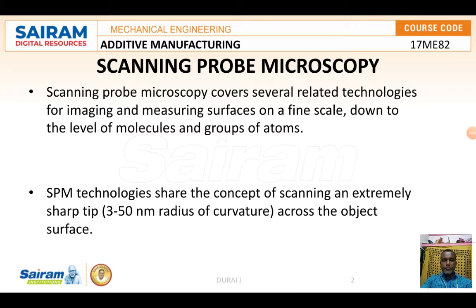Everyone, in this video we are going to discuss scanning probe microscopy. Scanning probe microscopy gives researchers imaging tools, a specialized microscope that provides magnification for observation of three-dimensional objects. This renders enhanced images, showing specimen properties, response and reaction, or non-action, when the specimen is stimulated or touched.